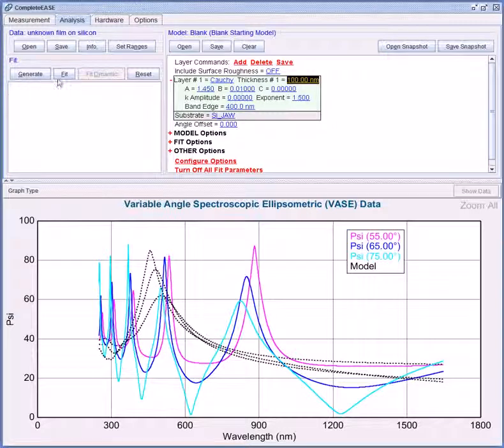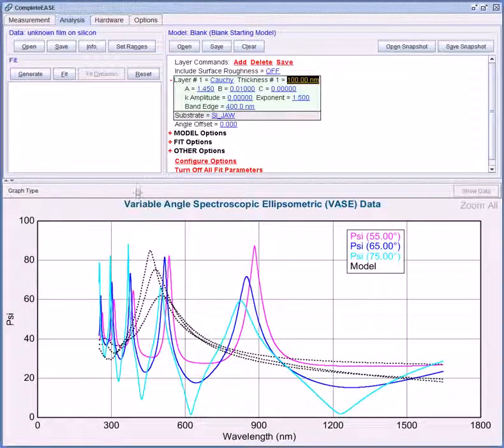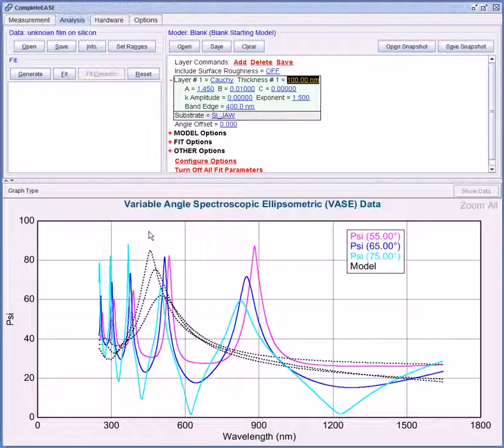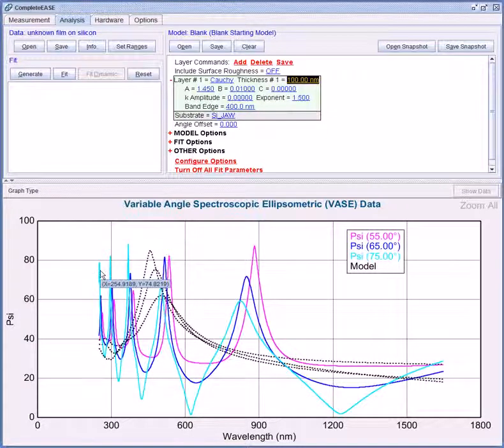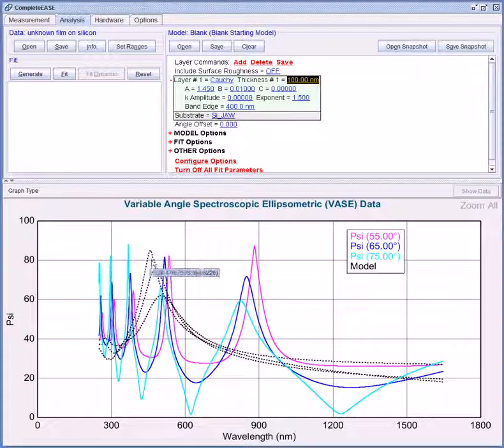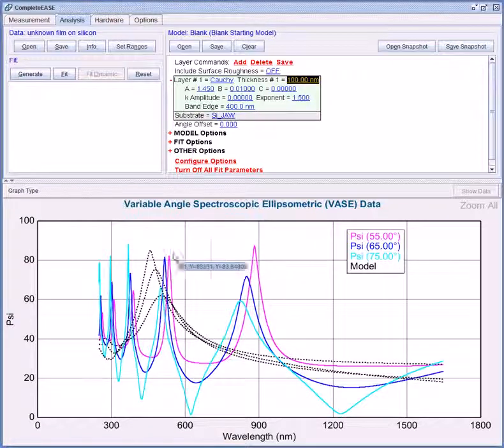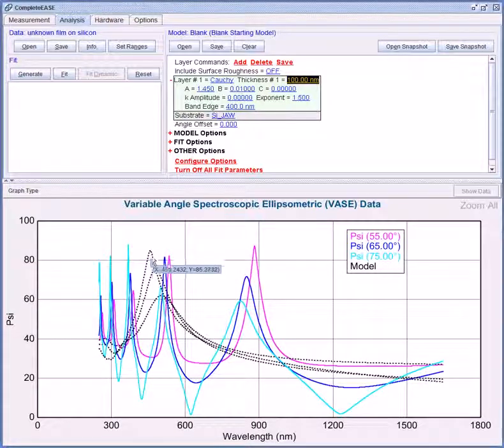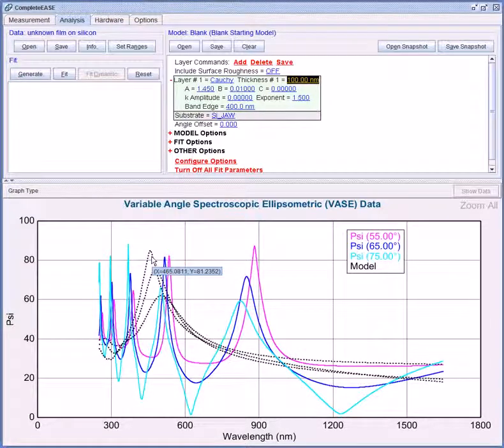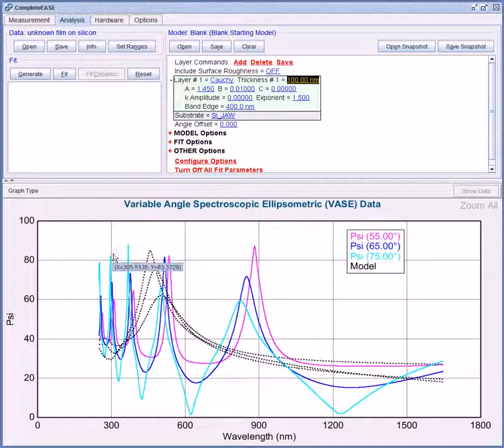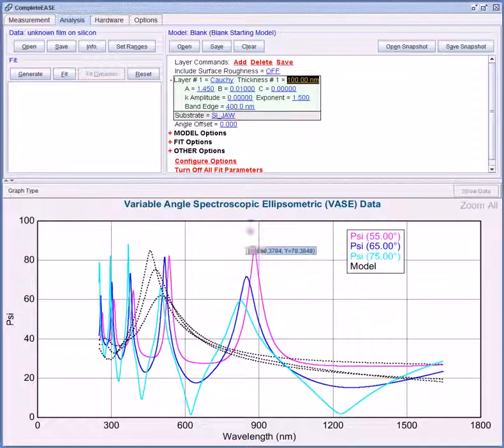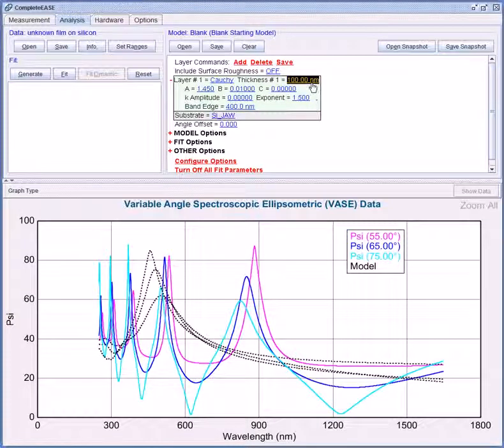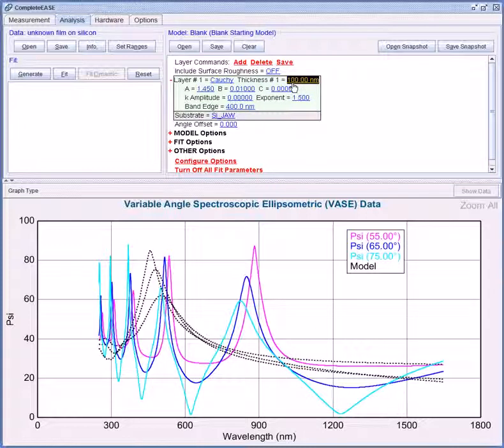From here we can make some educated adjustments to the model that will give us closer starting values. The number of oscillations in the data is related to the film thickness. So I notice my model generated data has one oscillation whereas my experimental data has five oscillations. So the starting guess of 100 nm is too small.